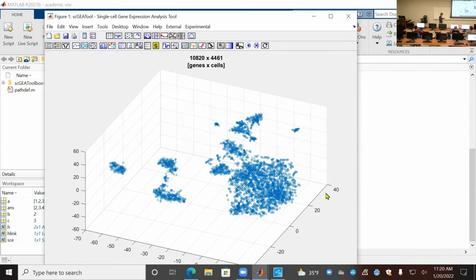Yeah, so that's my 2000 gene. Similar, same. Okay. By the way, t-SNE is a stochastic process, so this time we don't expect exactly the same. Maybe still, I don't know if you have this. Same, okay. Cells use gene as a feature, to look at the similarity between cells.